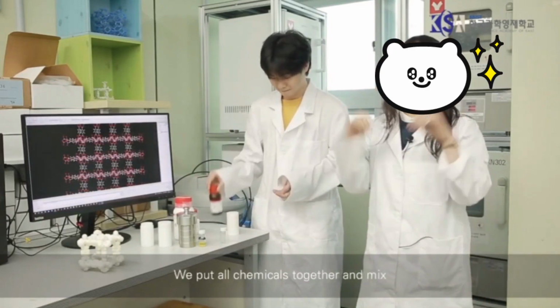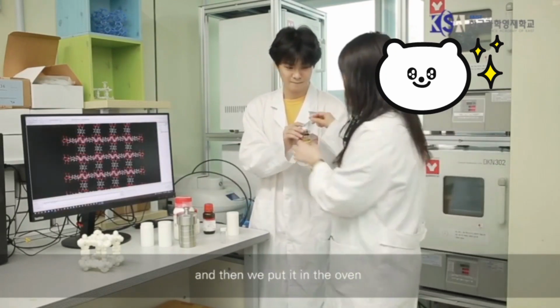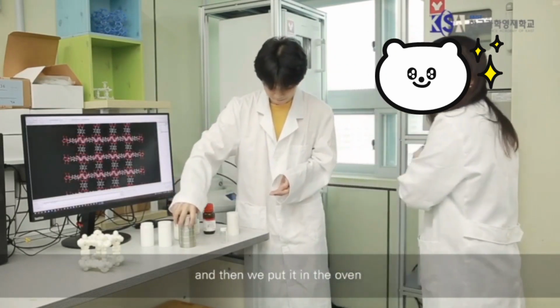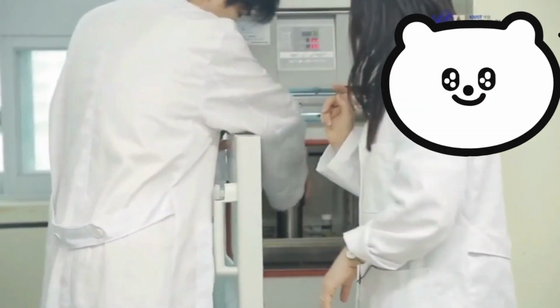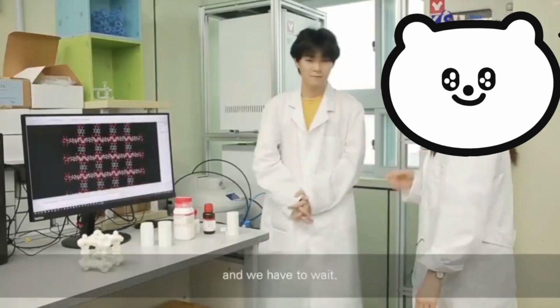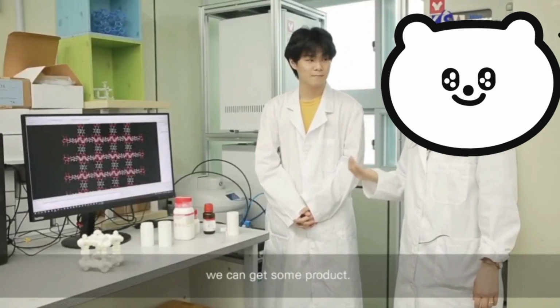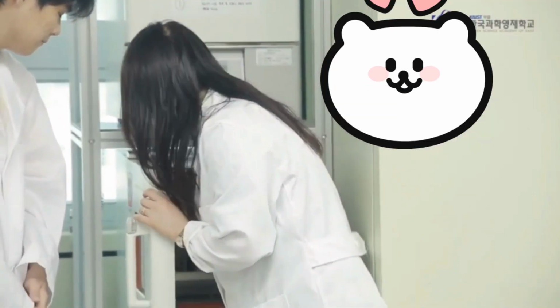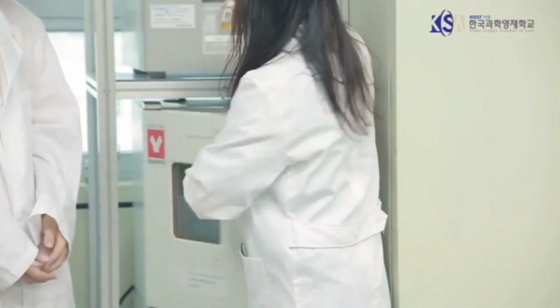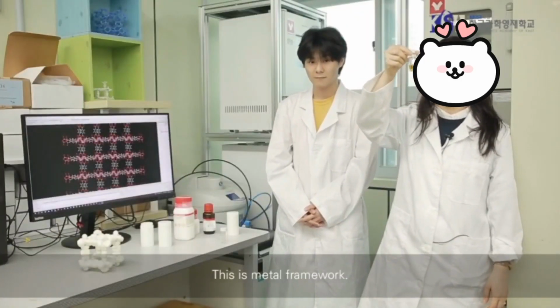We put all chemicals together and mix, and then we put it in the oven like this, and we have to wait. So after several days we can get some product.